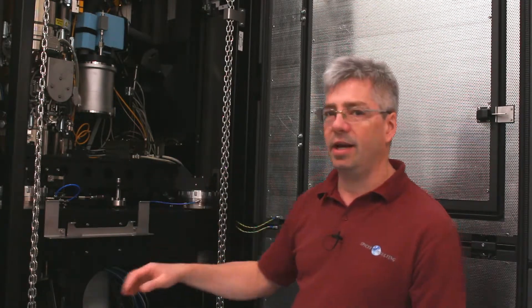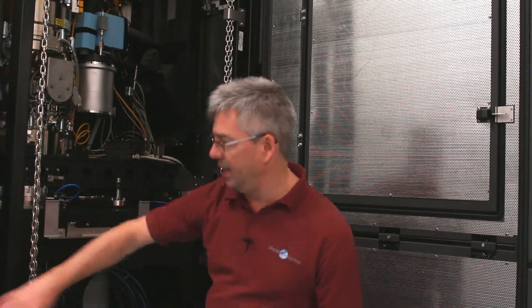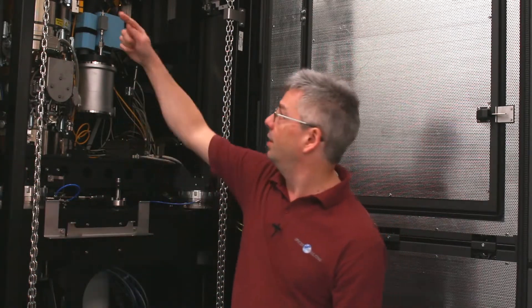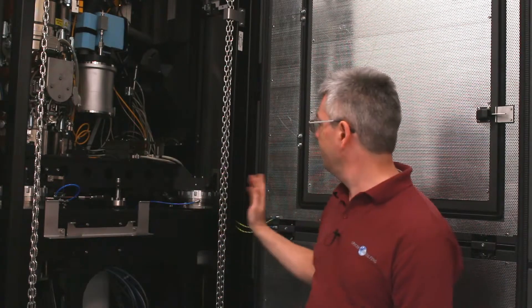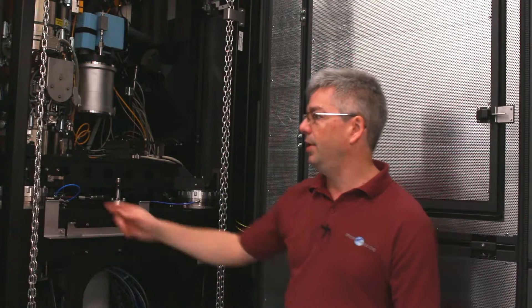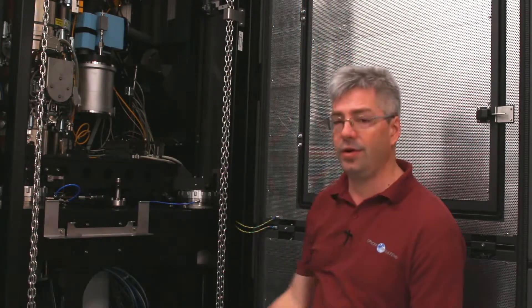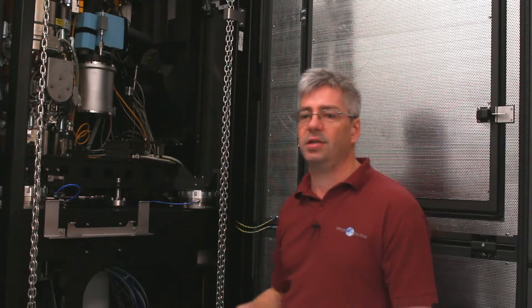The Z cable goes around the room because that doesn't get in the way, but the X and the Y have to go inside the cabinet. They are running here so we have a loop that goes around the front and also around the back, and we have loops on this side and on the far side of the microscope to create uniform fields in all axes.